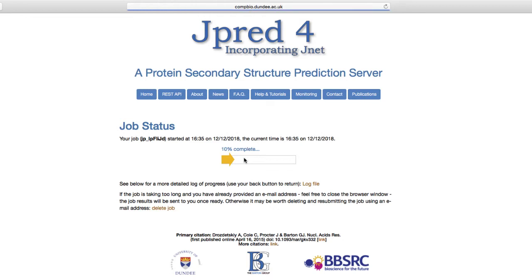JPRED estimates the workload of its computer clusters and where the job is in the list. At any stage, the current job can be deleted.